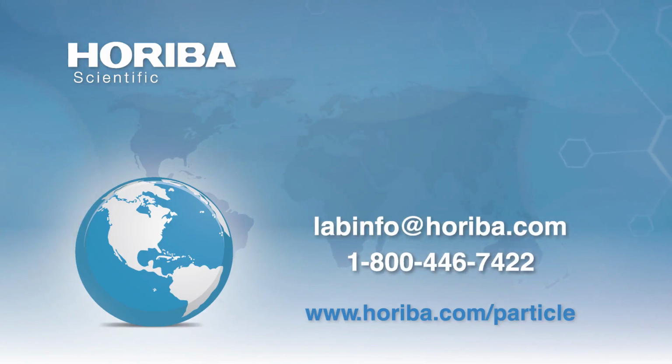How do you differentiate micelles from sample particles? Well, if your micelles are about the same size as your particles, you can't. I've seen samples where it looks very much like I'm looking at some micelles and some analyte particles. What you can do is analyze just your surfactant package and see what particles you measure. And if you find out that you have 100 nanometer particles from your surfactants as micelles, and you're trying to measure 100 nanometer particles of protein aggregate, for example, you're in trouble. So you might start thinking about what you can do to label the more interesting part of your sample, or what you can do to cut down your surfactant concentration.